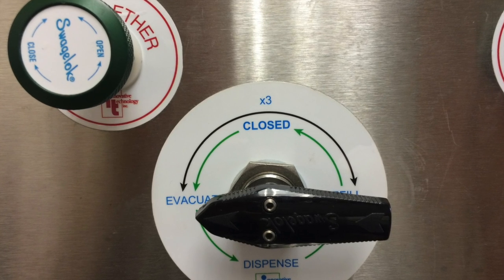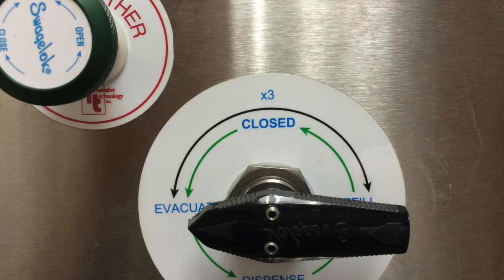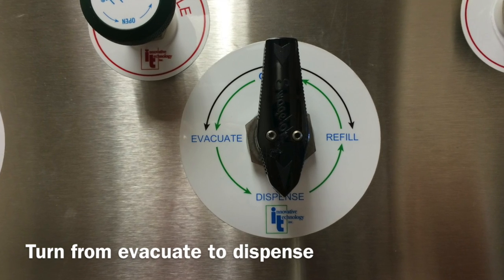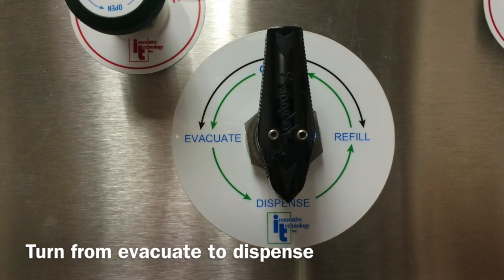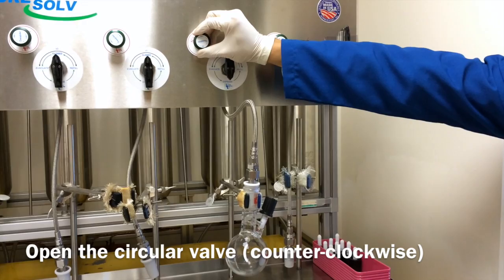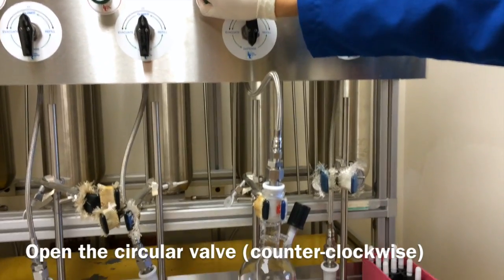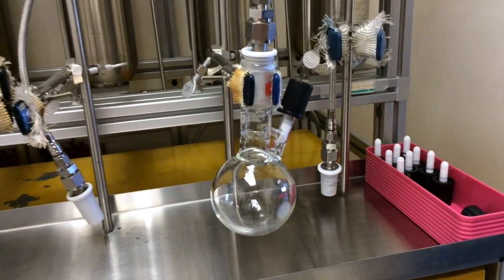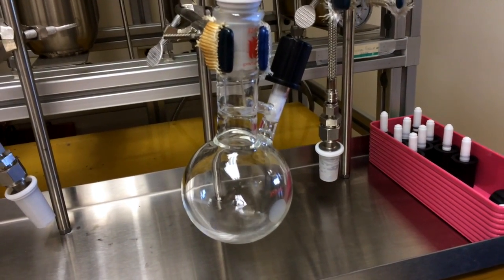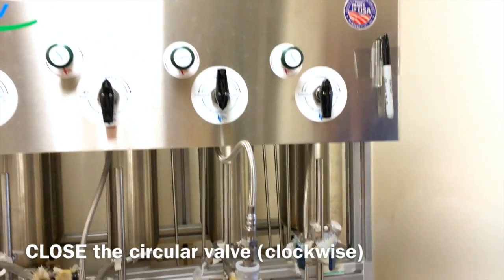Because you're trying to add solvent to a closed system, the flask must be under vacuum before dispensing can begin. Turn the valve from evacuate to dispense. The circular green valve controls solvent flow. Slowly turn the circle counterclockwise to begin dispensing your solvent. To stop dispensing solvent, turn the circular valve clockwise.